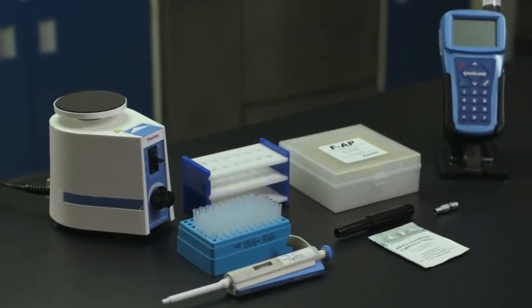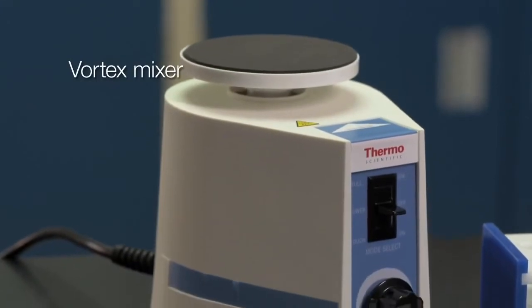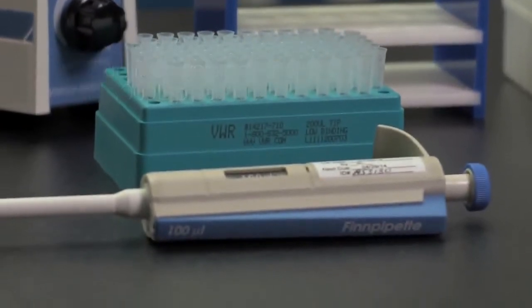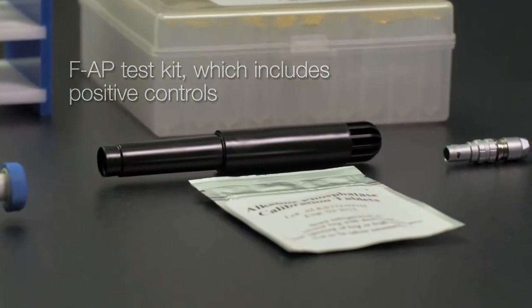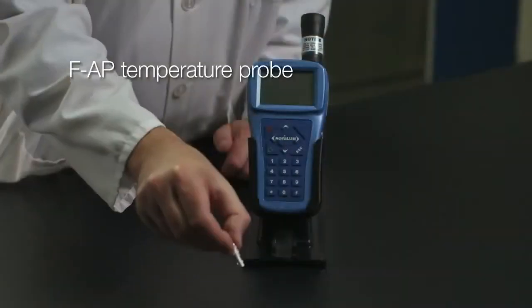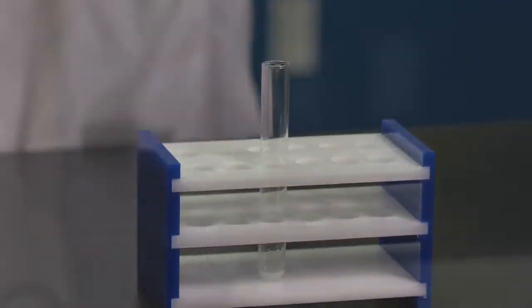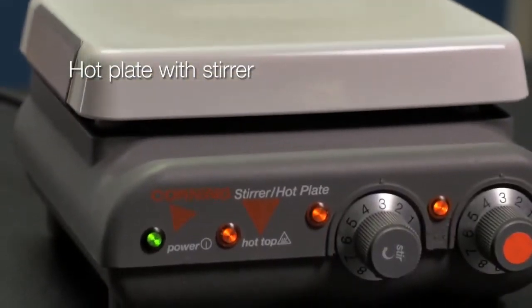To perform CHARM's FAP test you will need a vortex mixer, a 100 microliter fixed volume pipette and 100 microliter pipette tips, an FAP test kit which includes the positive controls, a NovaLUM with stand, an FAP temperature probe, a micro centrifuge tube stand, and a hot plate with stir which is needed for lab pasteurization of milk.